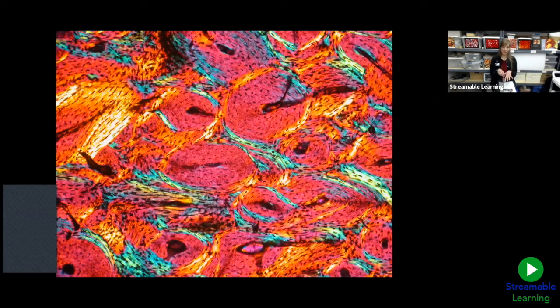Yeah, it's the light condition that a polarized light microscope can create by having a polarizer and an analyzer create a polarized light stream. You place your specimen in that light path, and then you'll get the light and dark. Awesome. The colors are then introduced by using something called a wave plate. I can pull mine out of the microscope and hold it up.